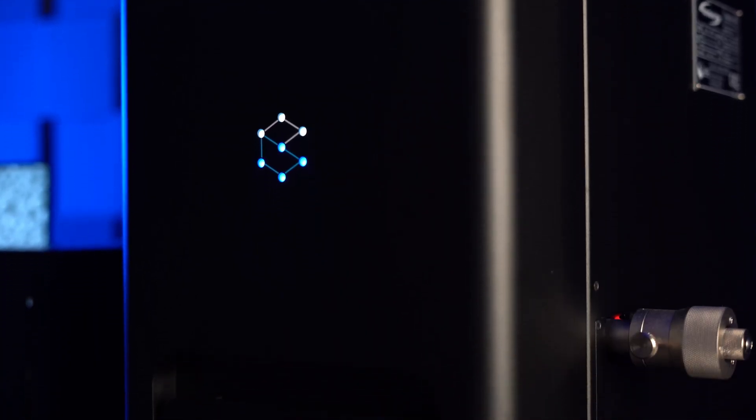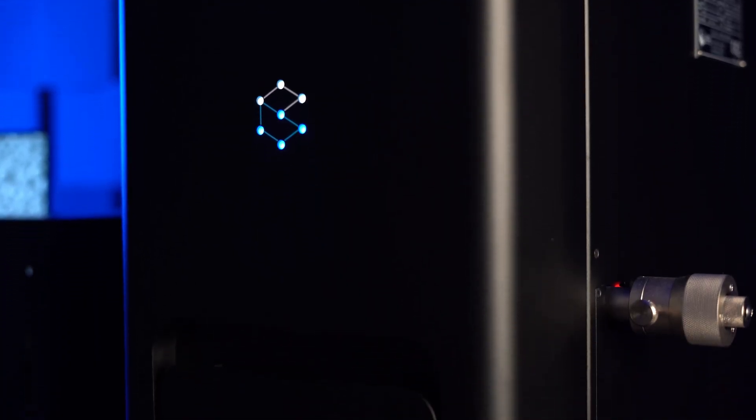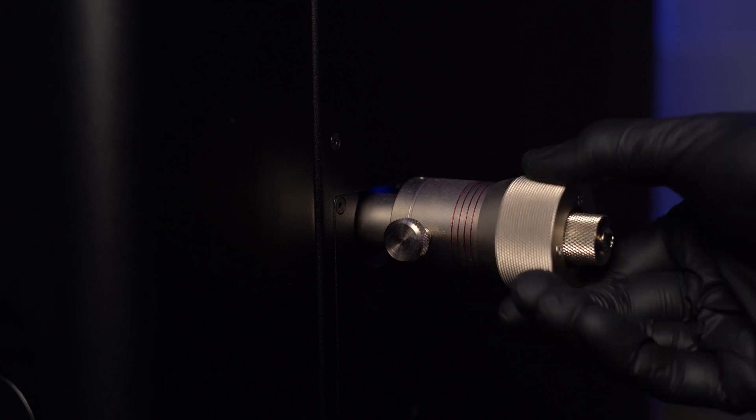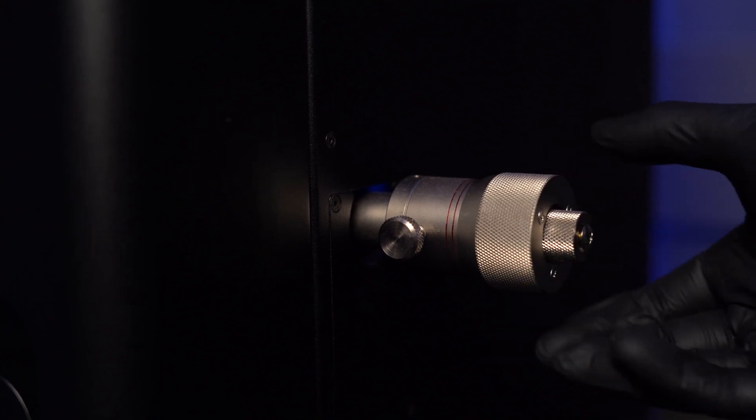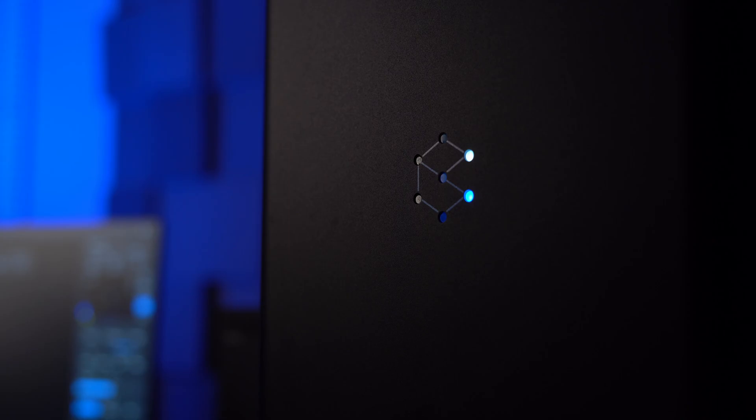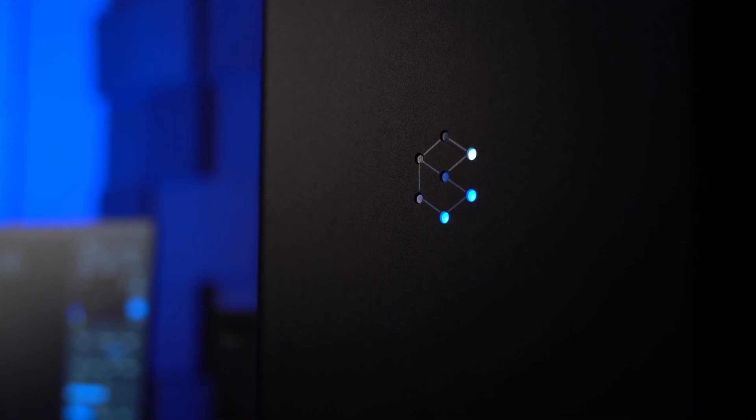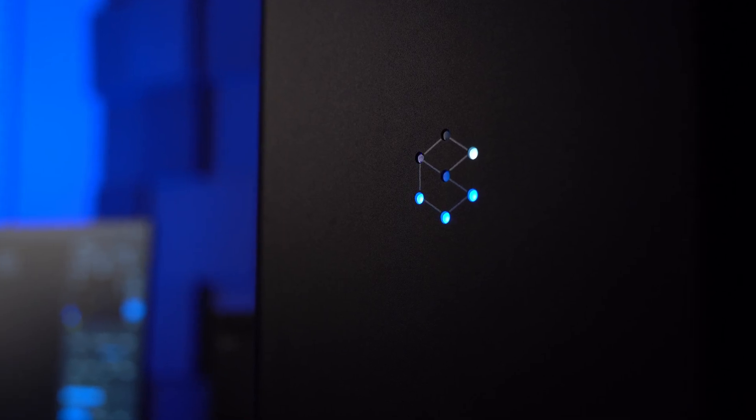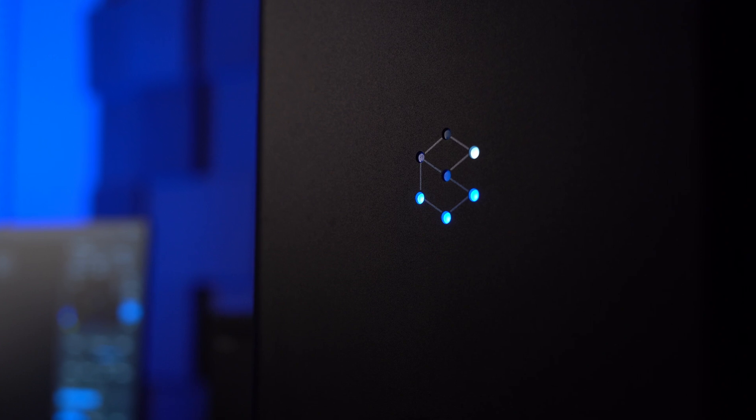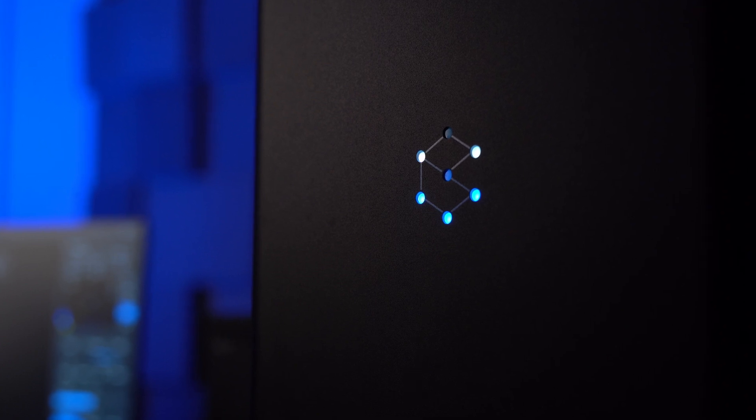No buttons at all, everything motorized except of aperture knob. It's manual but pretty solid and easy to use. I was also impressed with the SEC logo, which is actually a vacuum progress bar. Love it.